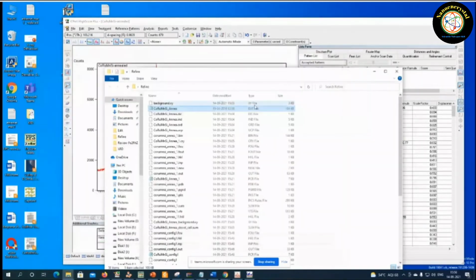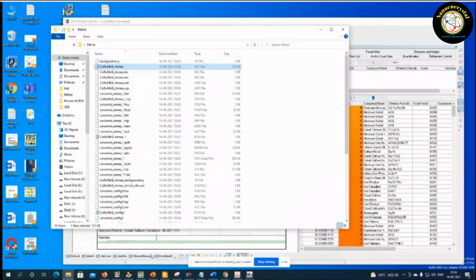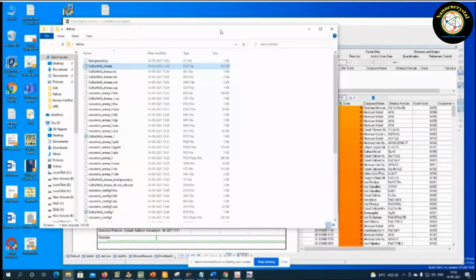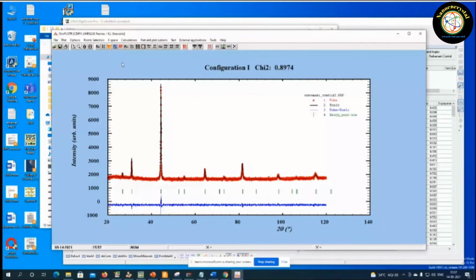Excuse me. Yes. Could you please tell once again, in the starting you told about peak matching. How did you match the peaks? Just at the start, when you were starting from this FullProf Suite programs, and then peak matching you have done? Sorry, in FullProf, you are saying? Yeah. Which step didn't I make clear? In the starting you told about how to match the peaks.